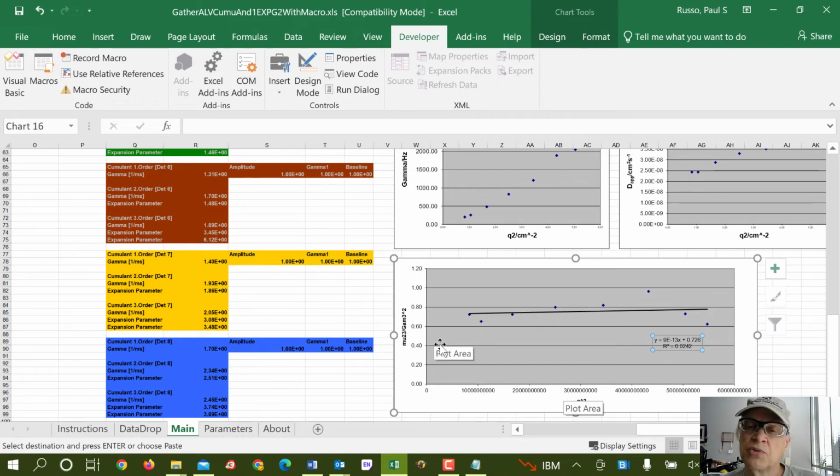And what you see from the trend here, there's a slight upward trend. I don't know if that droop there is to be regarded as realistic or not. But if we did believe in this upward trend, it would be telling us that the data are getting somewhat more non-exponential at high angles, which would suggest that we're starting to pick up the end-over-end tumbling of the rods. That's the sort of thing that will lead to a rise in this mu2 over gamma bar squared parameter.